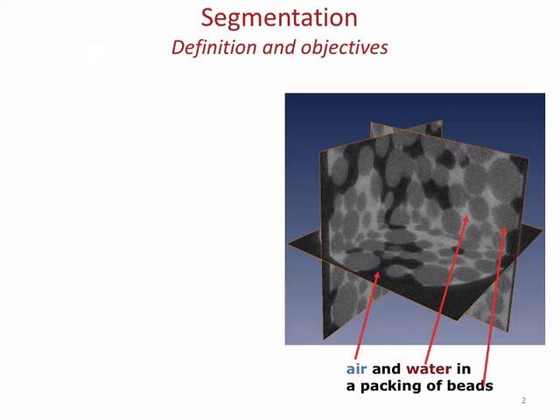If you're doing simulation, such disconnected objects can create issues. And if they're representing less than 0.01% of your phase, it's not going to really affect your solutions in a major way. So first thing first, you identify how many and how much of them are there, and then you decide which ones to remove.